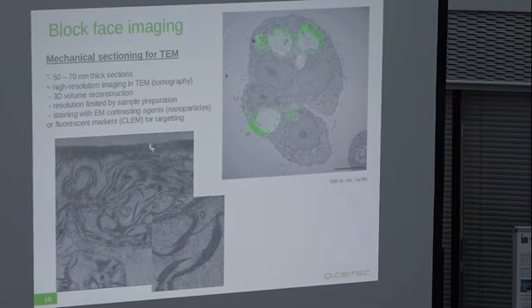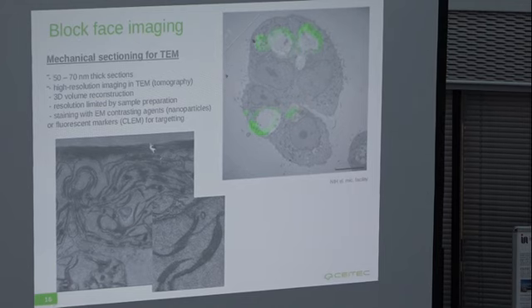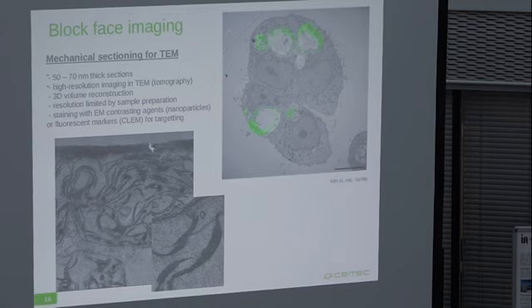However, once you have the slices, you can also use additional EM contrasting agents, such as nanoparticles or fluorescence markers, to interact with the surface exposed residual proteins' functional groups. And then you can fairly precisely target, using correlative light and electron microscopy, the regions of your interest in these slices.